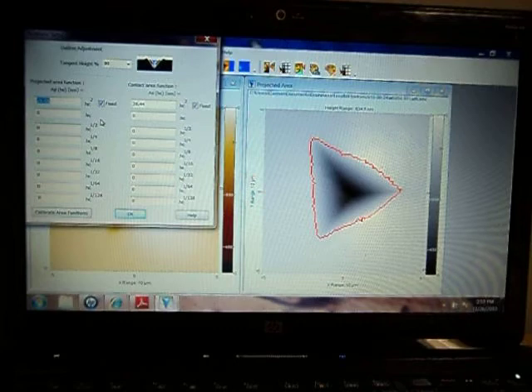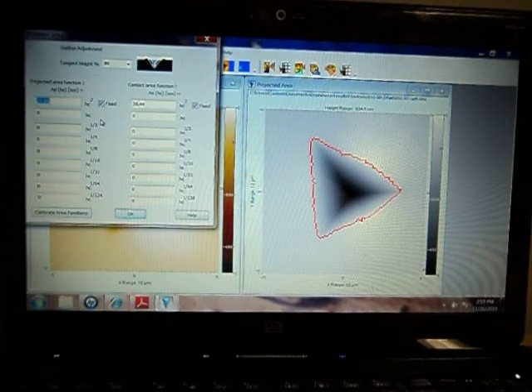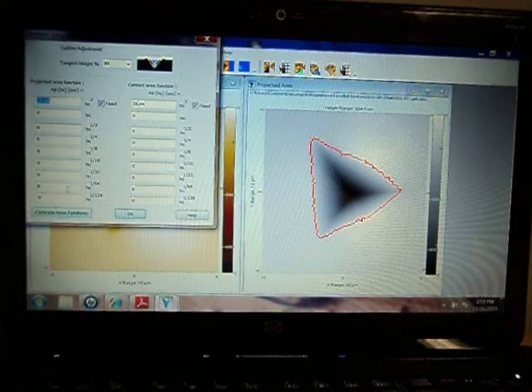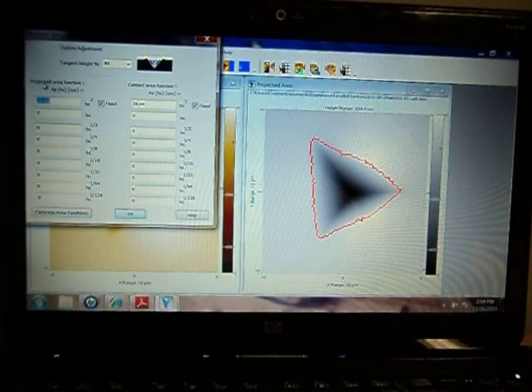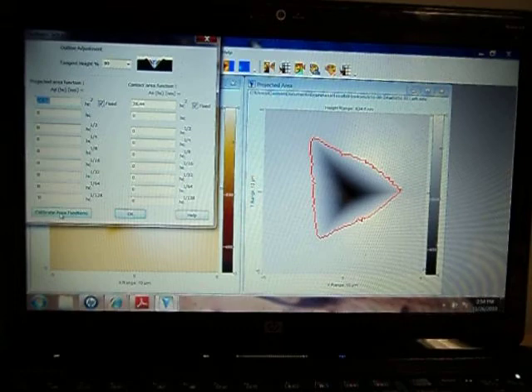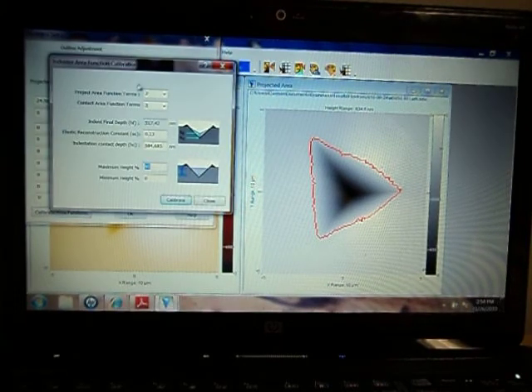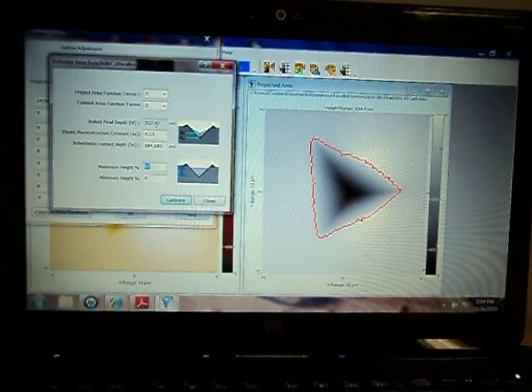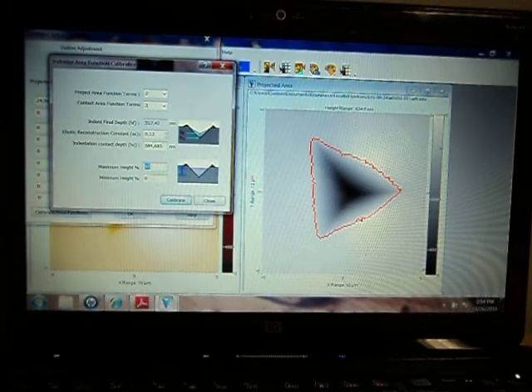However, indenters are not perfect. You need to calibrate the area functions because of tip rounding. You select the terms to use, the depth, and the elastic reconstruction constant.